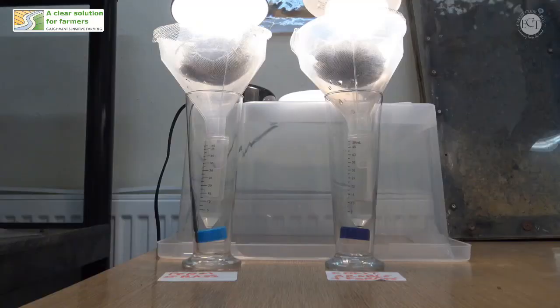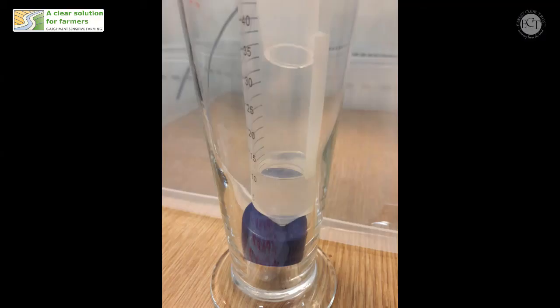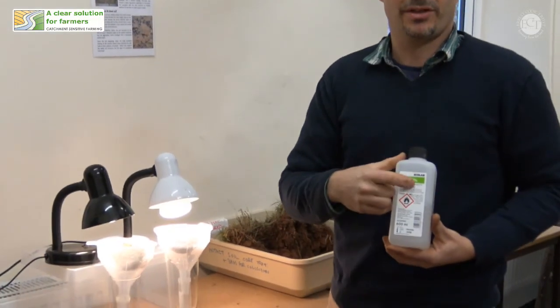The way it's constructed is we basically have a tall glass at the bottom, and inside that is a collection pot. This collection pot has got a little tiny drop of alcohol in the bottom — that's actually 70% industrial methylated spirits.